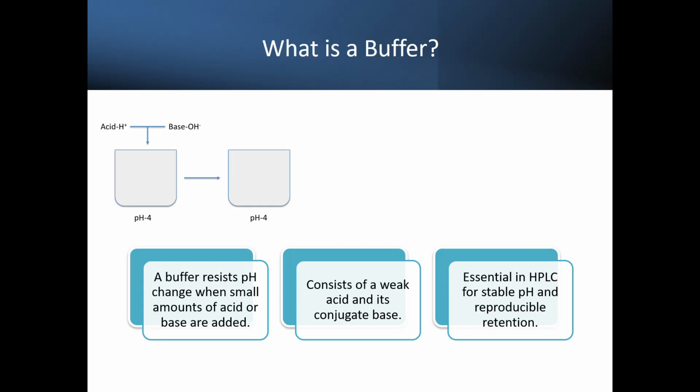So what is a buffer? A buffer is a kind of solution. Suppose this is a buffer. This is a solution with a specific pH of 4. In this particular solution, I'm adding acid or base, and after addition of a small amount of acid or base, the pH is not getting changed.